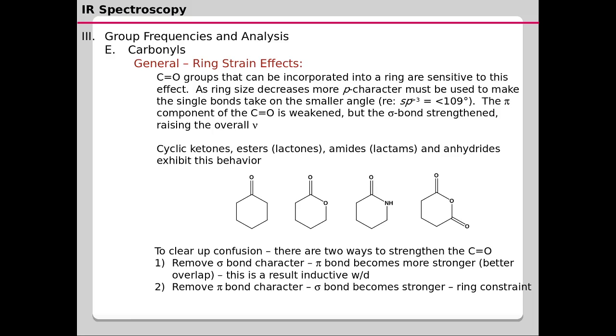We are going to use the same approach here, and again I'm going to give this as an exercise, because we have discussed this before in the case of exocyclic double bonds. If you consider cyclohexanone, the first molecule here, and replace the cyclohexane ring with cyclopentane, then it becomes cyclopentanone. If you replace the ring with cyclobutane, it becomes cyclobutanone. Then with cyclopropane, it becomes cyclopropanone.